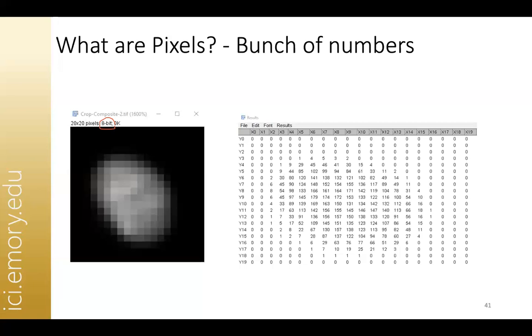So all the numbers are going to be between 0 and 256. The way I like to put that is you have 0 as your black, and you get different shades of grays over here. And the shades of grays go from 0 to 256 in the values, okay?